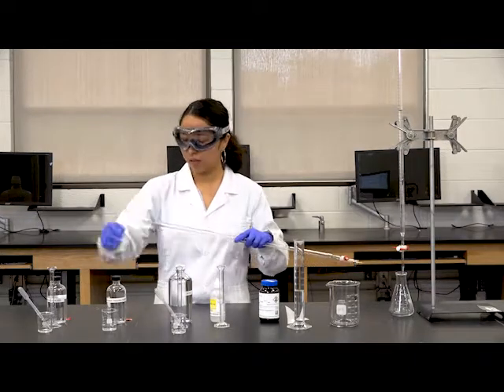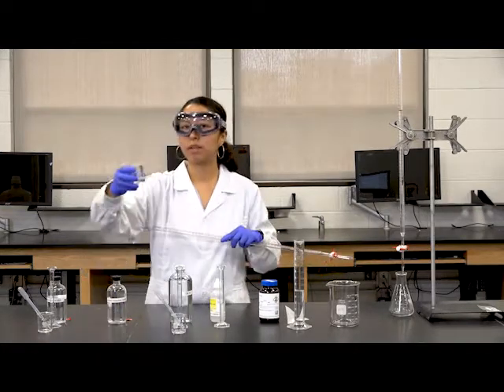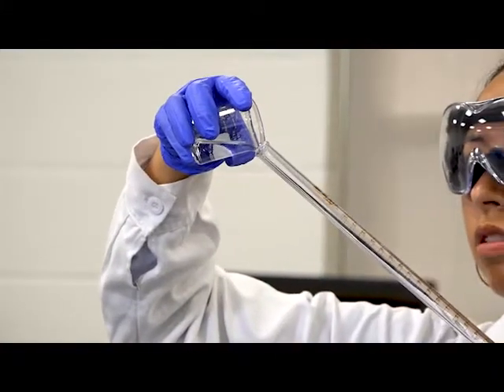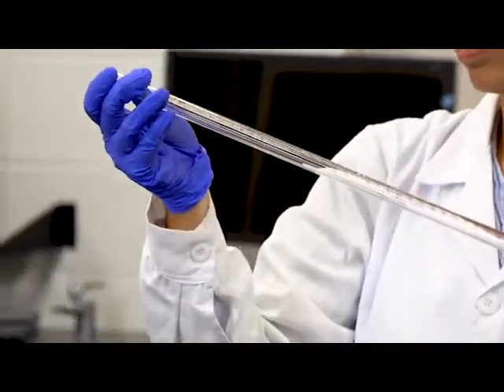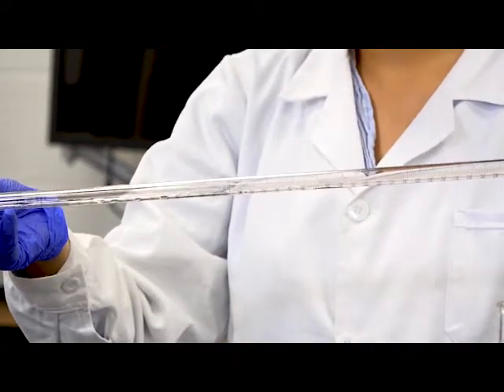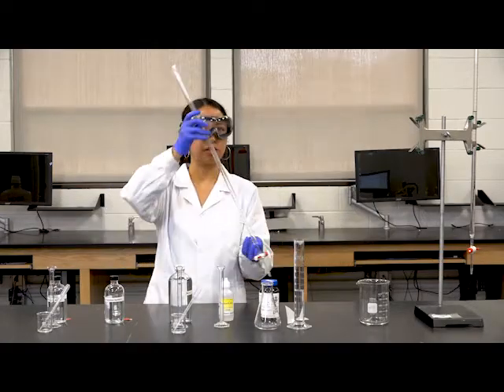To clean it, you need to get the solution that you're going to titrate with, in this case sodium thiosulfate, put a little bit in a small beaker, and put it inside your burette, just like 1 ml, it's fine. Now you're going to take it sideways and rotate. Make sure that the solution is touching all the way to the 0 mark. Once you rotate it once or twice, you're ready to decant the solution.